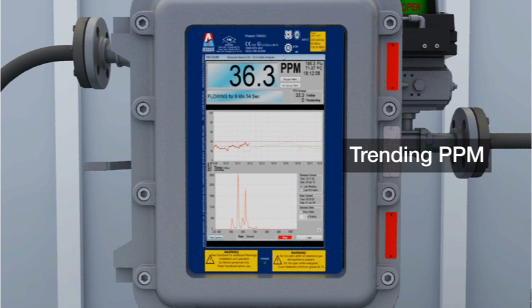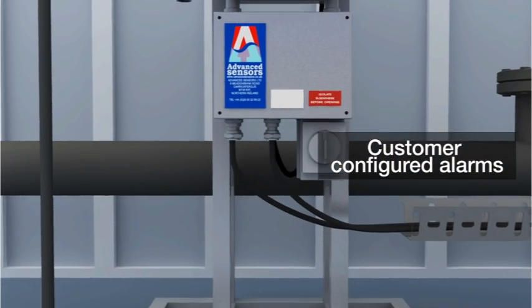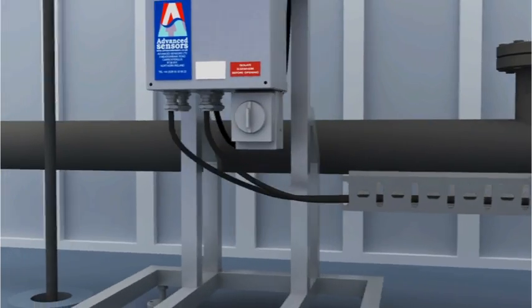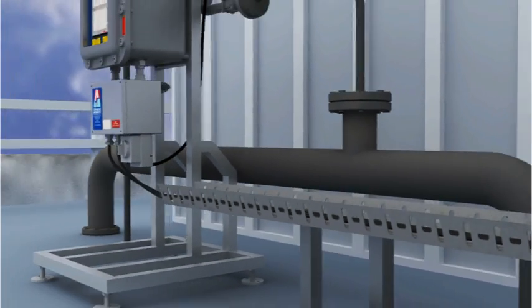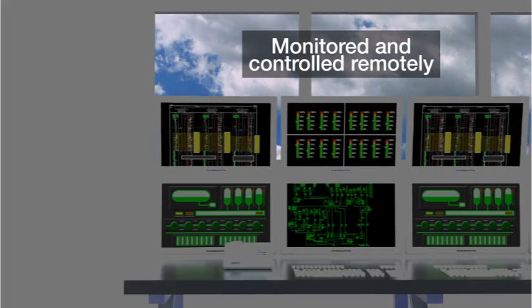If customer-configured alarms are broken, the analyzer will report through a number of avenues, including 4-20mA, HART, MODBUS, ADSL and Ethernet, all of which can be monitored and controlled remotely.